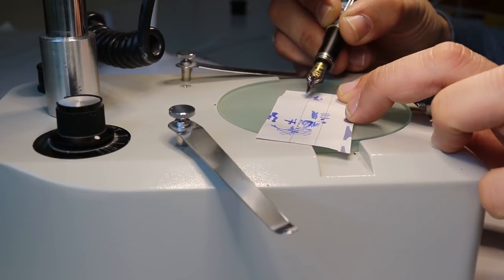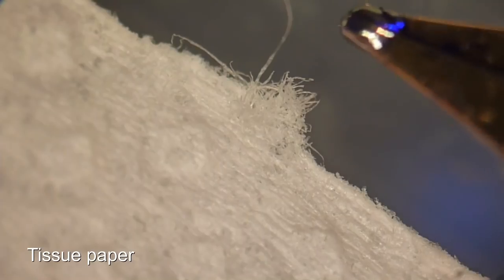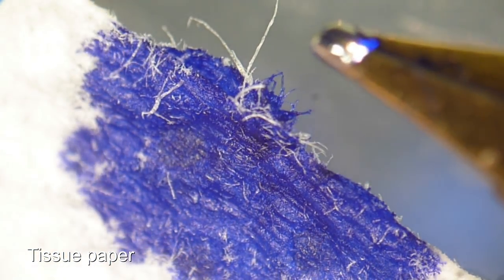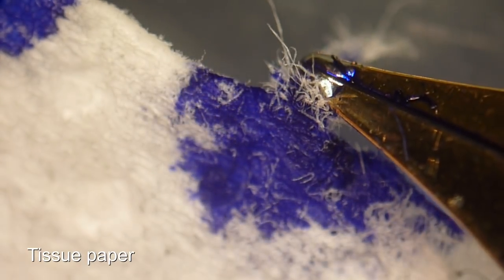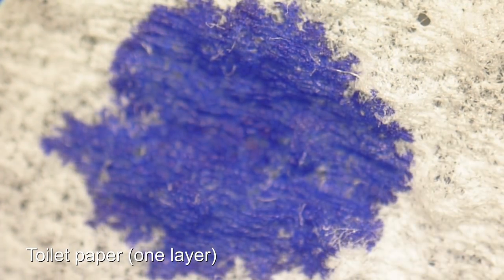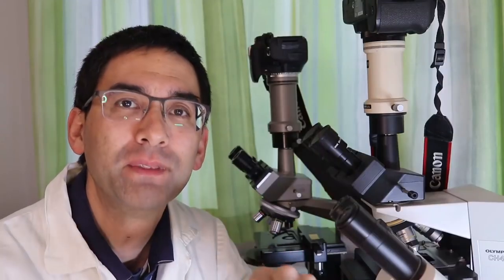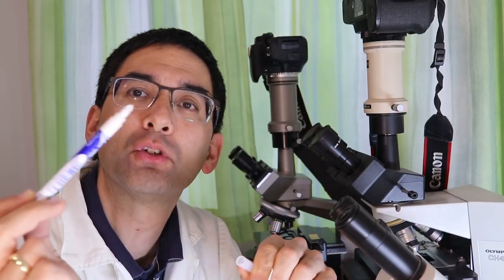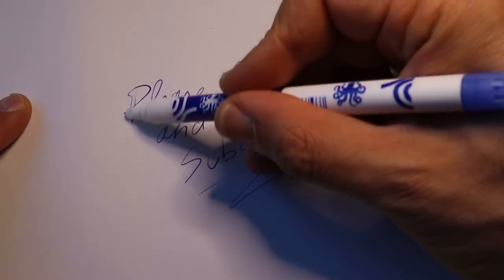It's a little bit difficult to write that precisely under the microscope, so I had to hold the piece of paper very tightly. And also the tissue paper fibers are very nicely visible now. Toilet paper has several layers, and now I took one single layer. One of the really nice things is I also have here a correction pen, and this correction pen is able to do a chemical reaction with the ink, and therefore it's able to remove the ink again, and also this looks pretty nice.